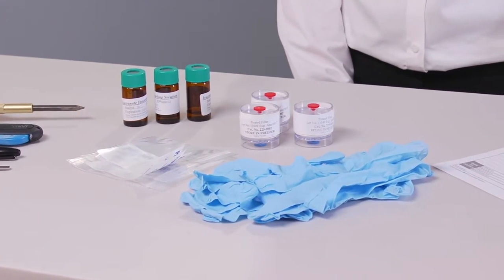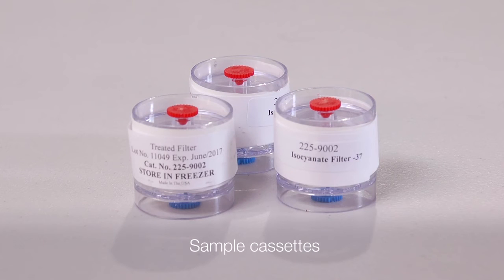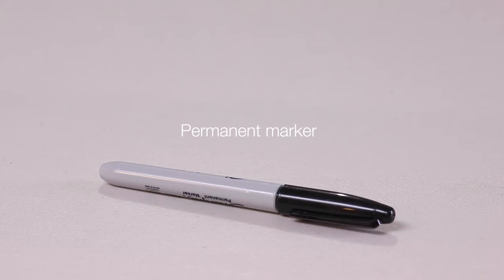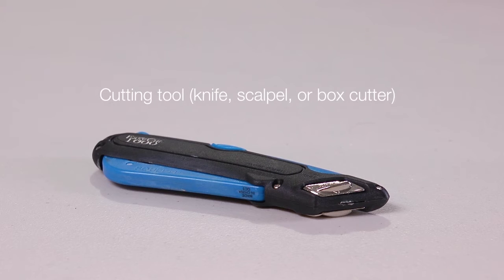These are the items you will need: sample cassettes including a field blank, laboratory supplied vials one per sample, permanent marker, cutting tool, knife, scalpel or box cutter.